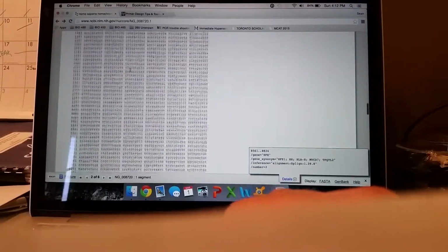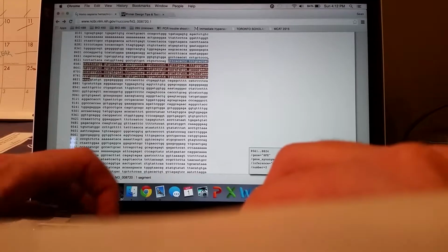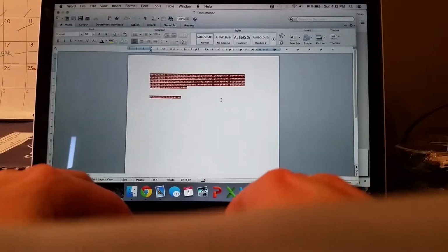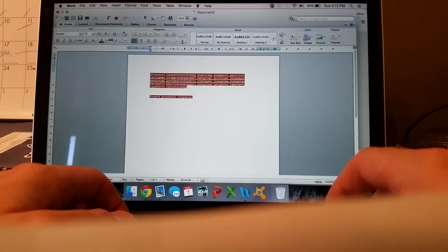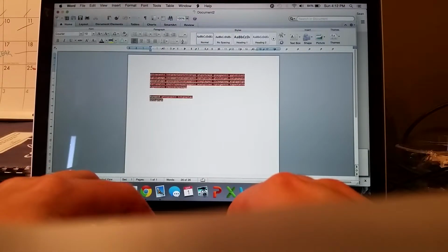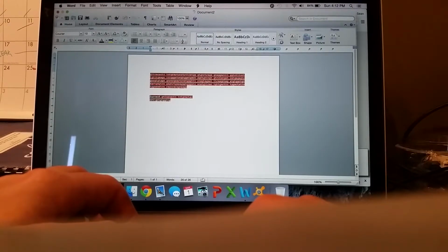So let's take our primers. We want GTT, blah, blah, blah. And this will be our forward primer. I hate that it puts that little brown stuff on it. Now for the reverse one, just read up there. What is that?